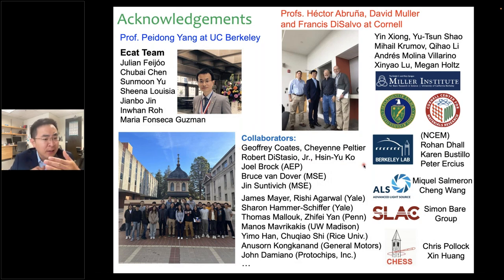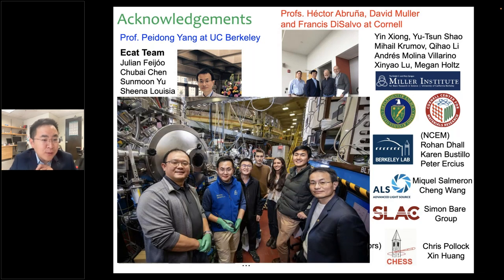You can see that we are increasingly beginning to merge the development of TEM with synchrotron beamlines. I would like to use this picture to conclude my talk. It is an example of how one can combine electron microscopy with synchrotron analysis to really show the complex nature of catalysts for the chemistry and energy materials community.